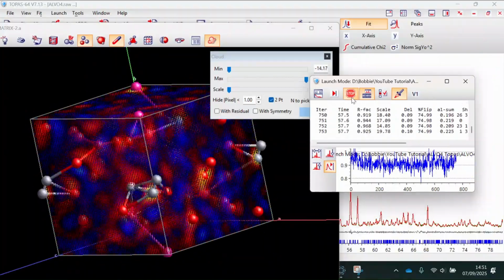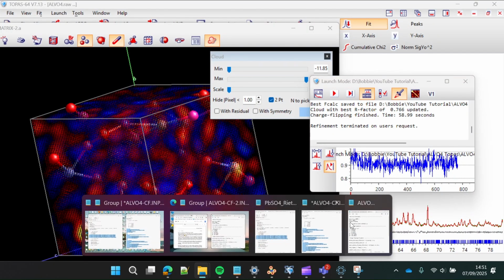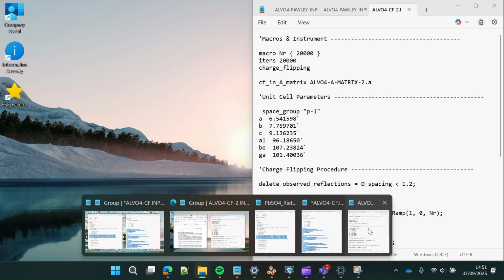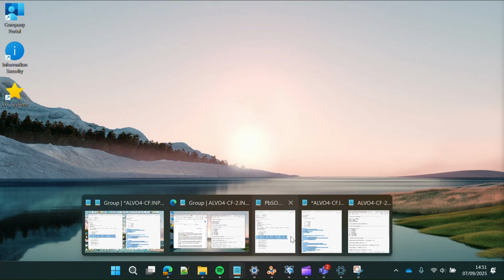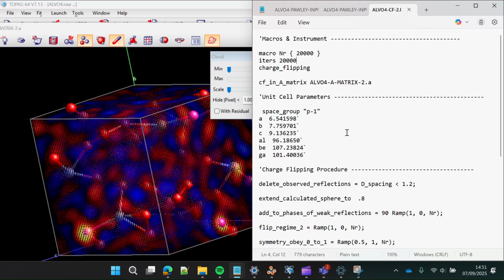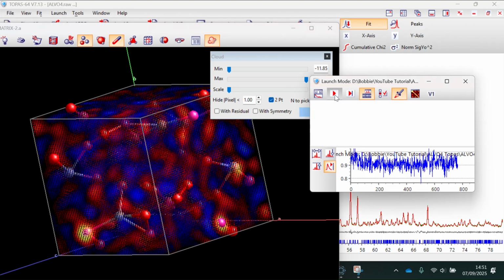But we're going to try it with a smaller ramp number, and see if we can find a meaningful solution in 1,000.